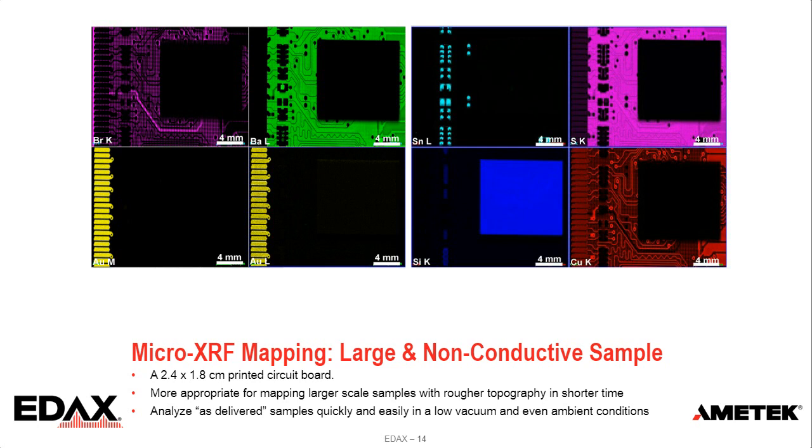The M line is more representative of the surface, whereas the L line comes from a greater depth underneath the surface, which is more representative of the subsurface presence of gold. In this case, the two maps are pretty much the same. This means that through the depth of the sample, gold does not change in distribution or area.